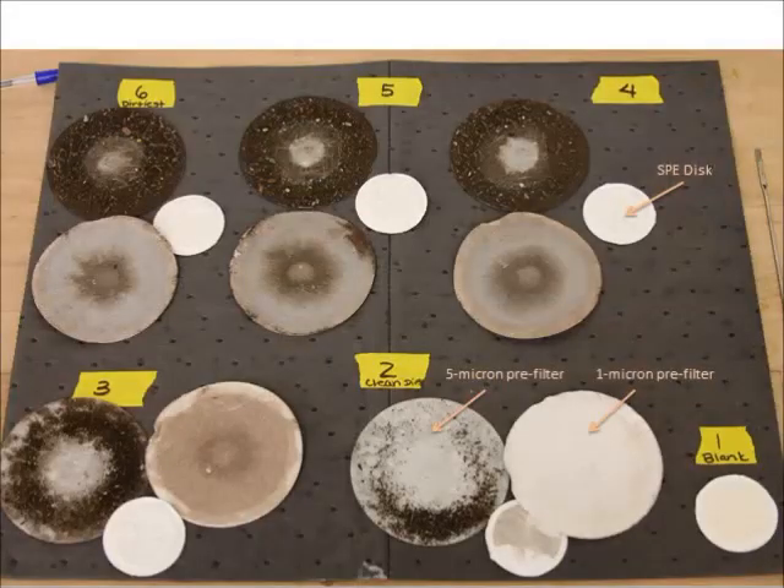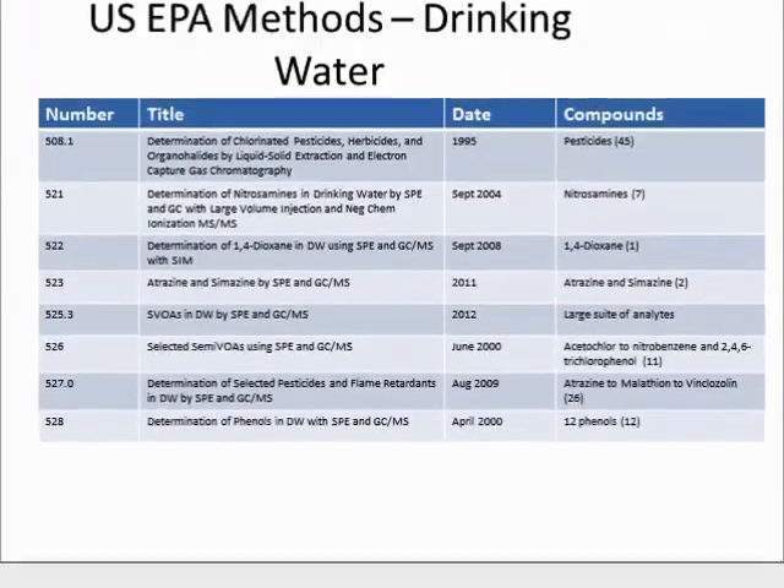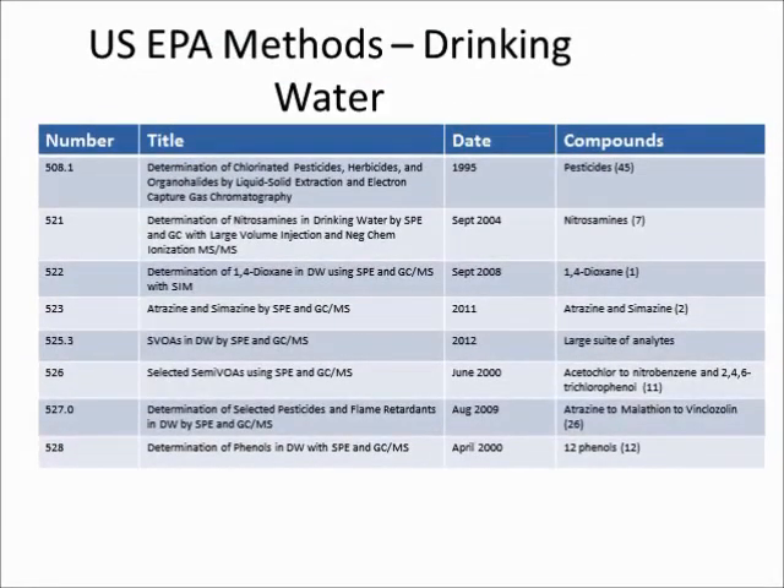Since these samples were particularly challenging, we used two pre-filters: a 1 micron pre-filter and a 5 micron pre-filter. You can see that the pre-filters are quite dirty, but the adsorbent disk remains pretty clean, so the solution was able to flow through it and the adsorbent do its job.